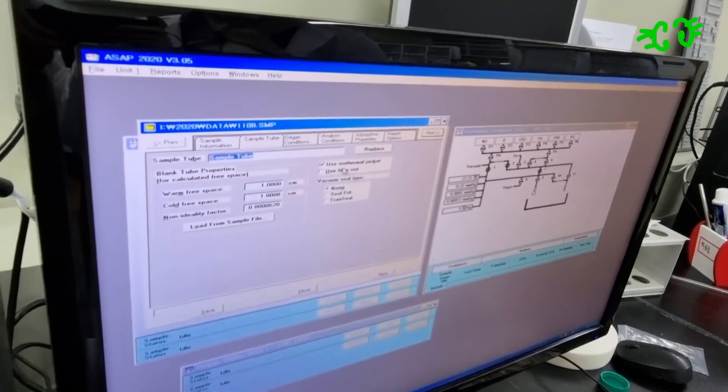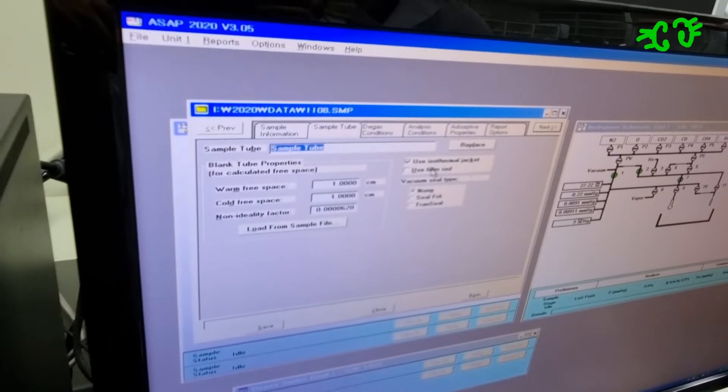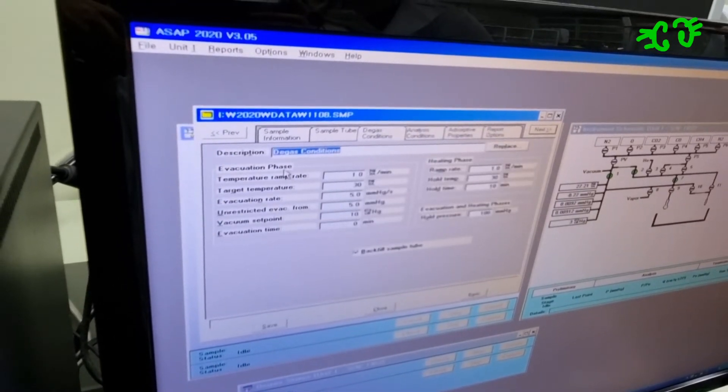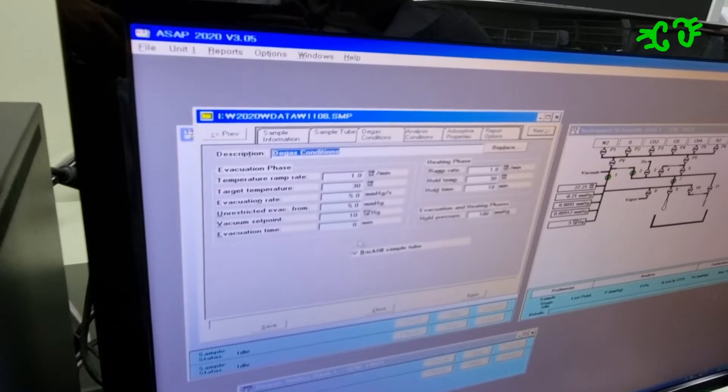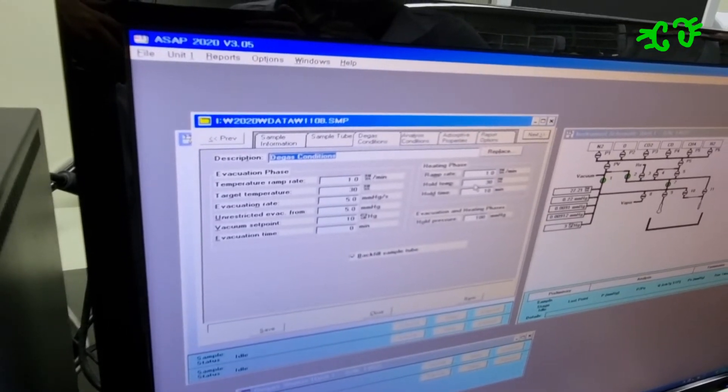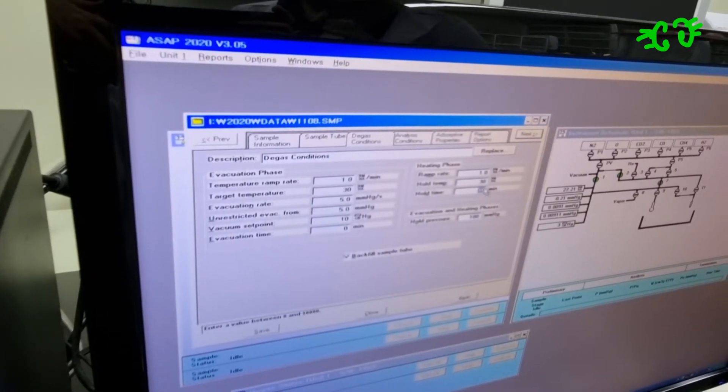About the sample tube, you should click the isothermal jacket. If you use a filler rod, you should check here. For degassing conditions, you can input the conditions you want. You usually replace this or this.